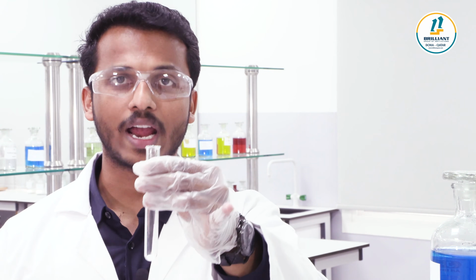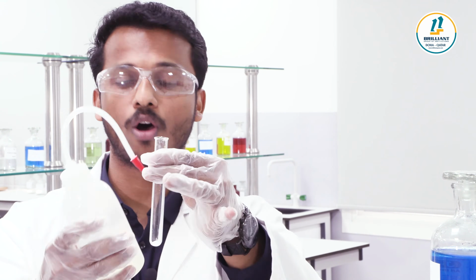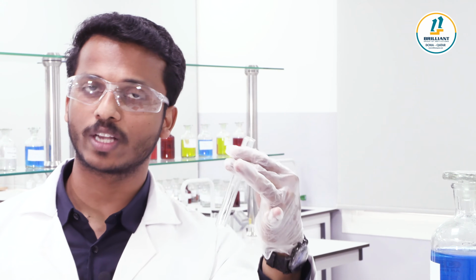To this I am going to add barium chloride solution, BaCl2. Before that, you have to make a solution of the salt. In the previous experiment we used the salt or the salt solution, and we can do it either way.